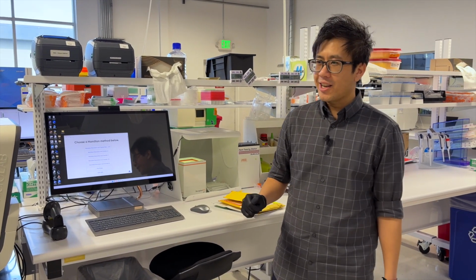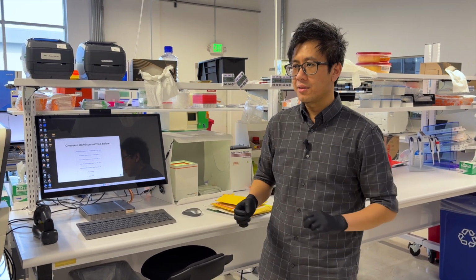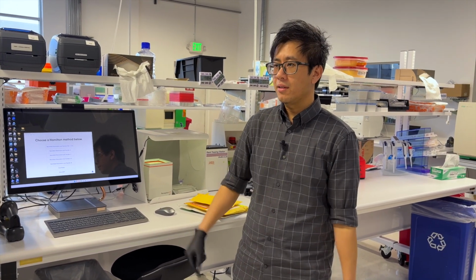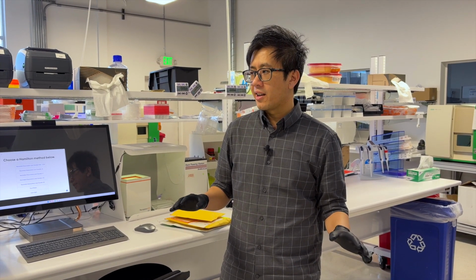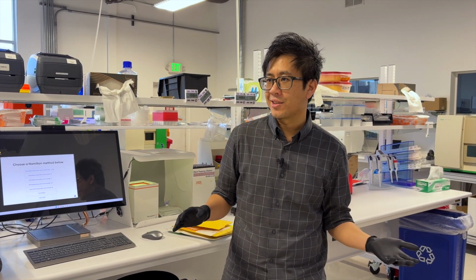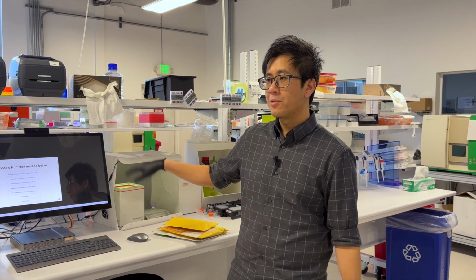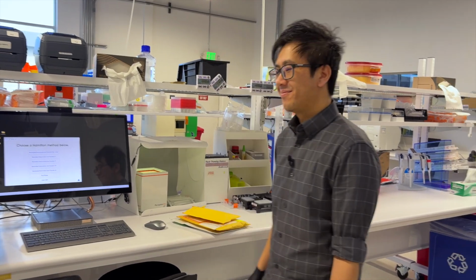I think just taking the time to work on all these little boring issues really adds up. It's more like you won't even notice how smooth it is. Otherwise, highly complex labs with lots of things going on can slow to a halt, not from any one thing, but really just from death by 1,000 cuts. And so that is another common theme we'll see here. Micro apps here that just solve the problem of help me start a method. Exactly, yeah. Cool.